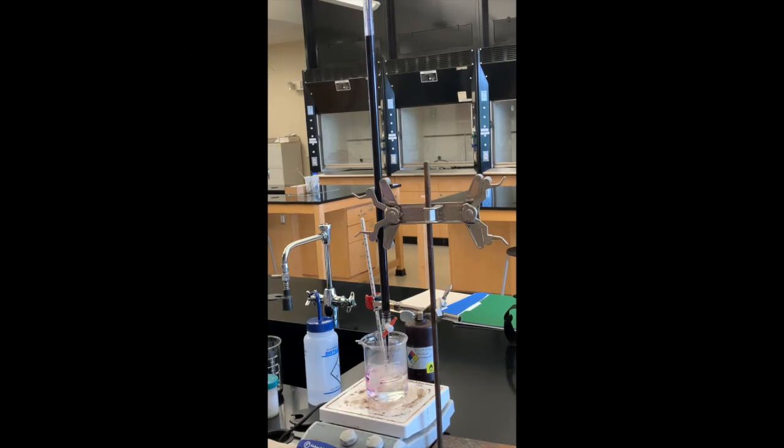Remember, for Part B we're doing this titration so that we can calculate the exact concentration of this potassium permanganate. Then in Part C you can use the exact concentration of your potassium permanganate to figure out how much oxalate is in an unknown sample.